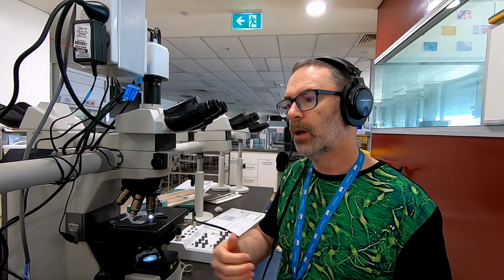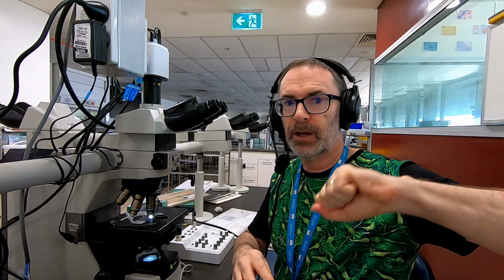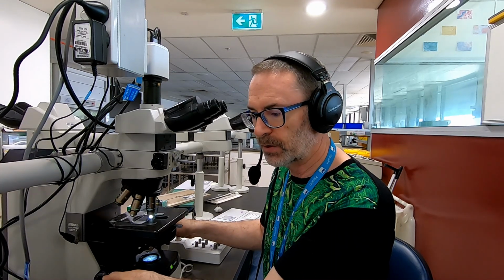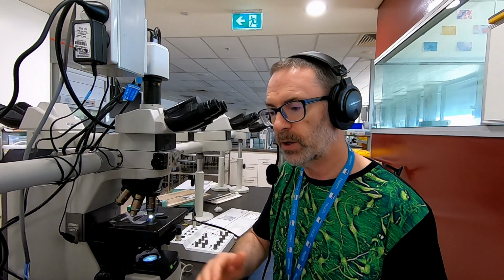That is, there is no negative charge within a particular saccharide group. There are just hydroxyl groups, and in particular, two hydroxyl groups located adjacent to each other, which when oxidized form a dialdehyde, which subsequently reacts with Schiff's reagent, which then, when you wash well with water, creates a conformational change within the Schiff's reagent such that it loses a sulfonic acid group, and then you generate this lovely pink color. So that's what's been done to generate this particular slide of colon, where we can see the pink and the blue stains working together.